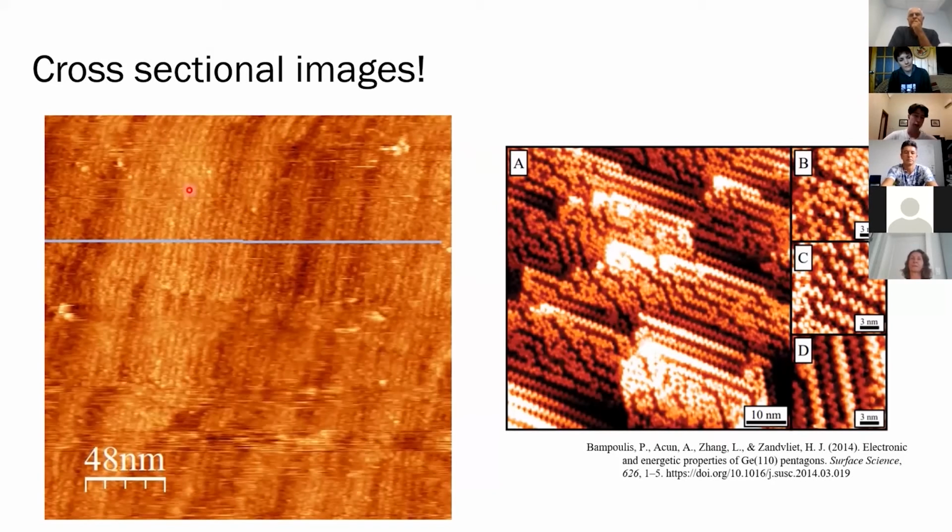with the STM and actually got an image of germanium cross-sectional atoms. We can see here a surface reconstruction of germanium atoms. Now, a surface reconstruction is essentially just when an open face of the material is exposed to vacuum, so it's not going to oxidize.